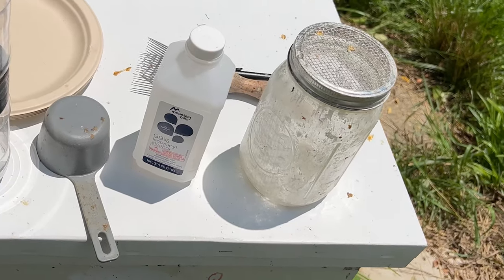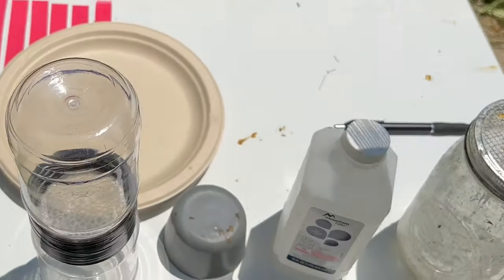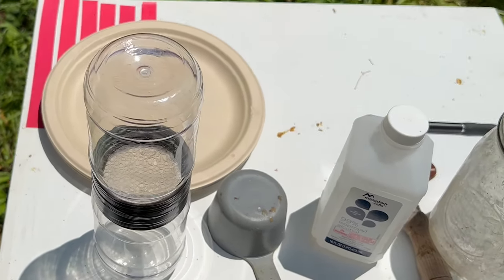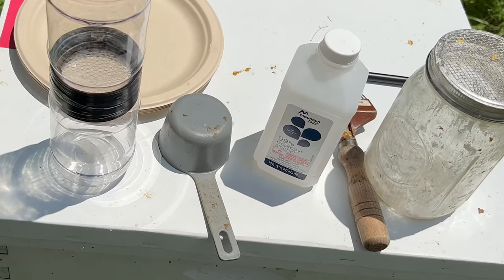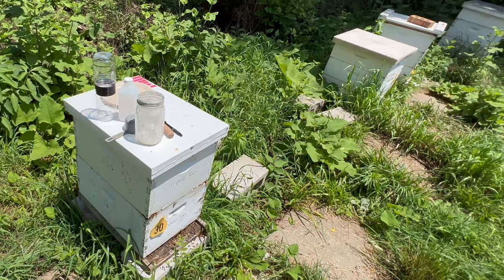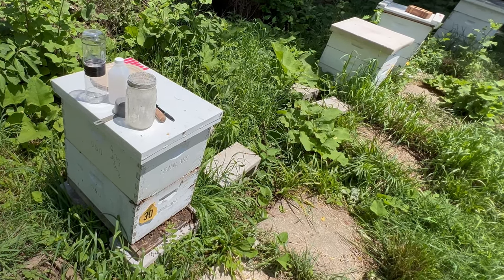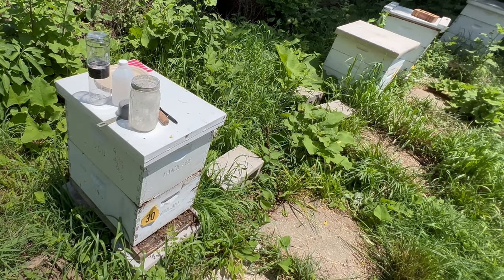Before performing my alcohol wash test I'm going to use this brood cap scratcher to open up a few broods and make a visual inspection. This is a less reliable sampling method since it's difficult to determine what percentage of the brood is infected. Varroa reproduce inside of capped brood cells, so their population levels can increase drastically in the fall just as a colony is starting to prepare for winter.